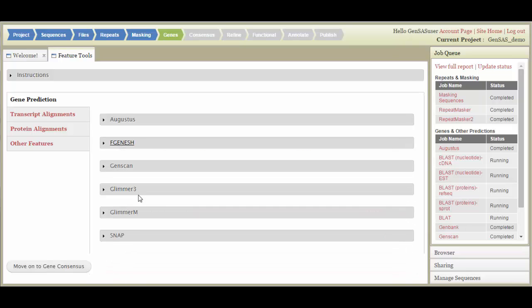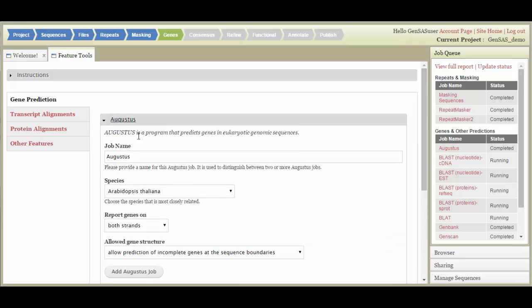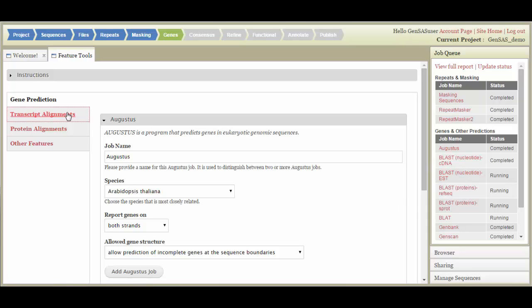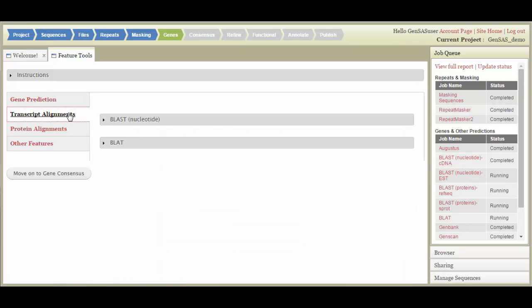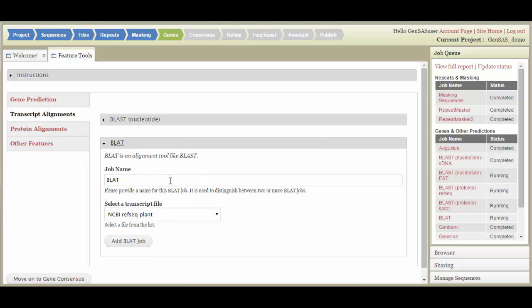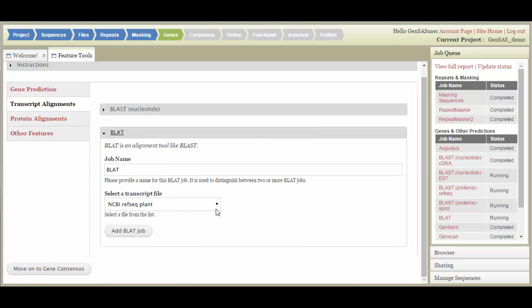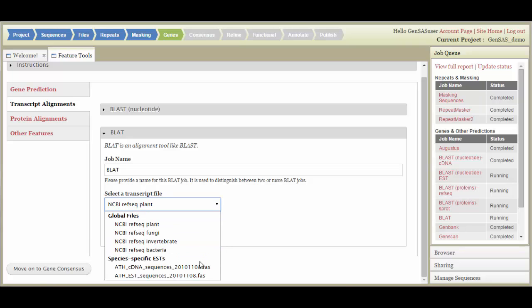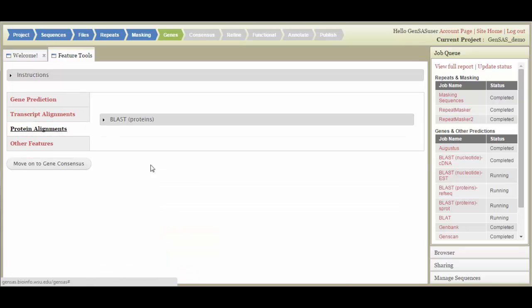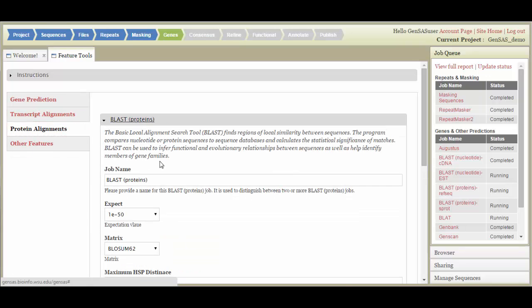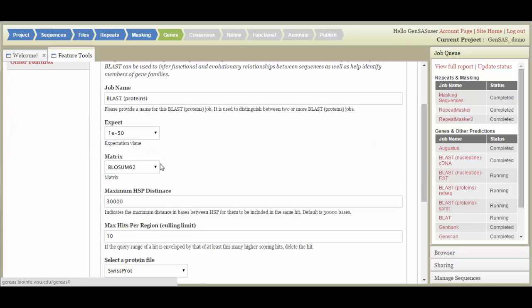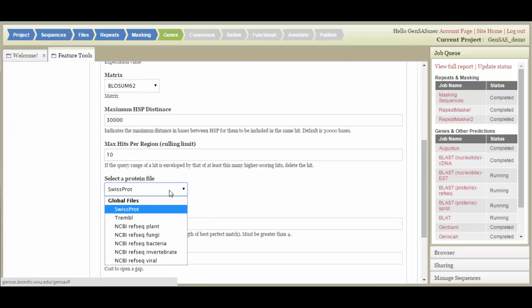Each of the tools has settings that you can change, and as with the Repeat tools, you can run multiple instances of each tool by giving it a unique name. Under Transcript Alignments, you can set up Nucleotide Blast and Blatt jobs. GenSaaS does provide RefSeq transcript libraries by default, but any custom databases that you uploaded under the File Step will be available here as well. Under Protein Alignments, you can set up Protein Blast jobs, either using the provided RefSeq databases, SwissProt, Tremble, or any custom databases you uploaded.